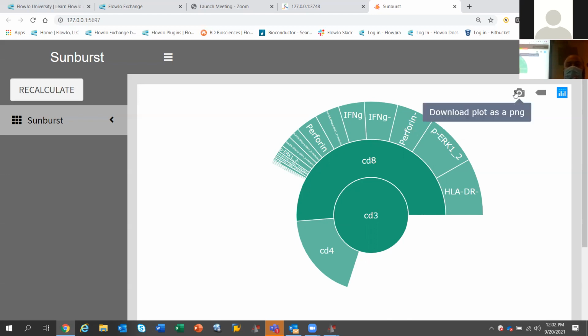If you want to take this as a picture, you could just download it as a PNG, or you could incorporate this when you're doing your presentation, especially if you're doing a lab meeting or a conference, then you could interact with this. That way you could tell your viewers what you're looking at.